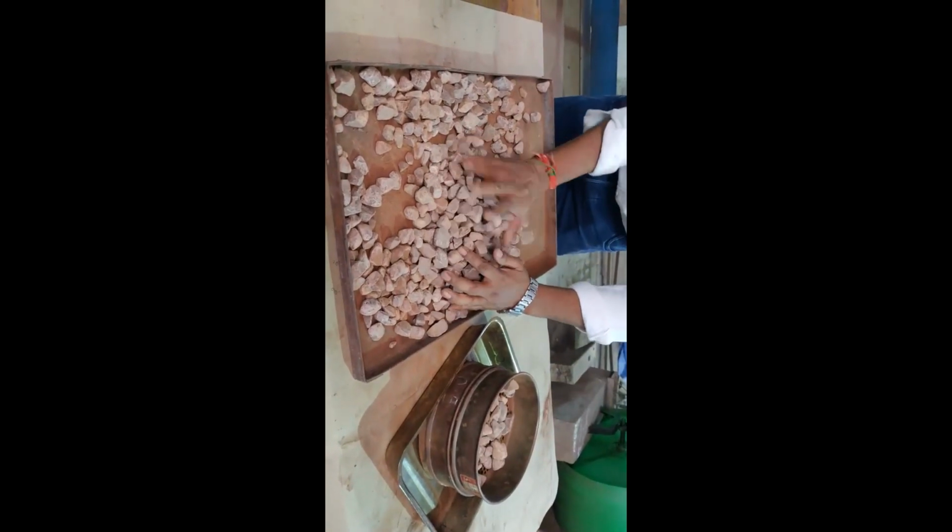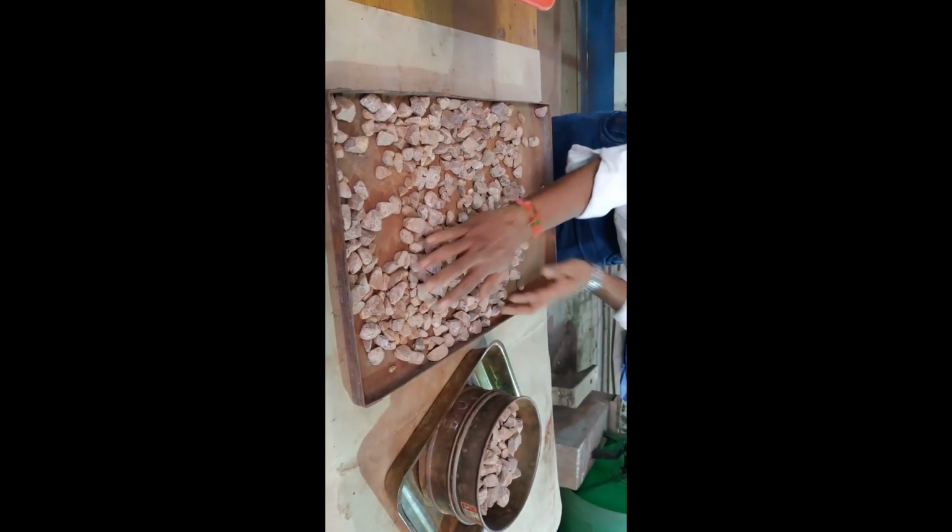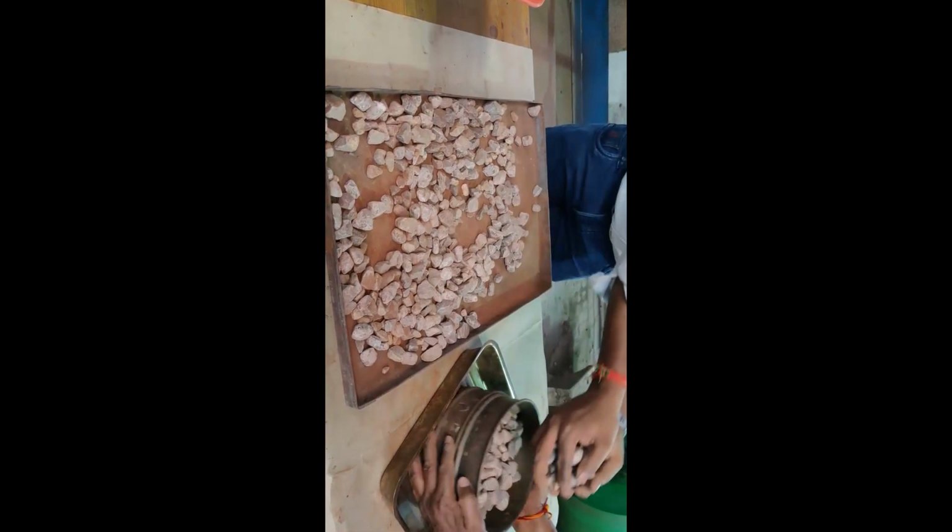We need the plus 6.3 fraction and the minus 0.5 mm fraction.